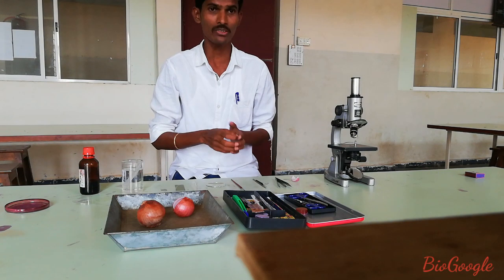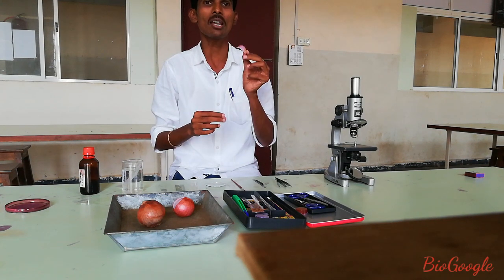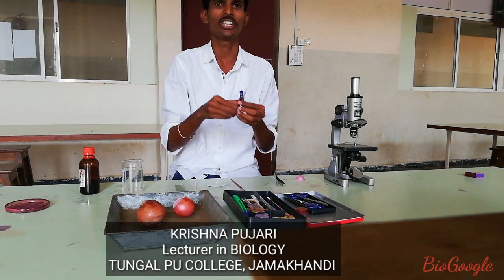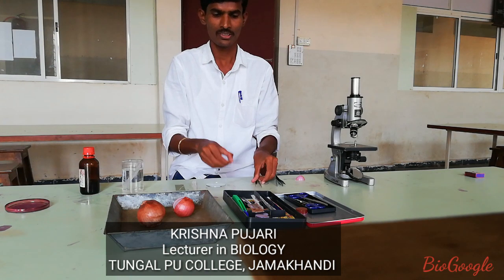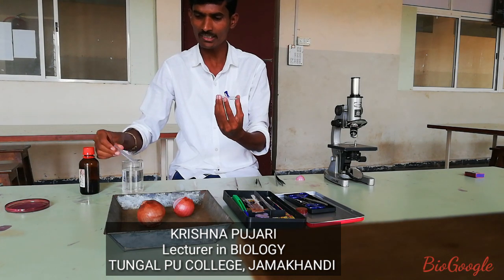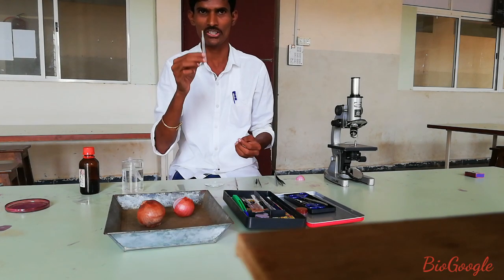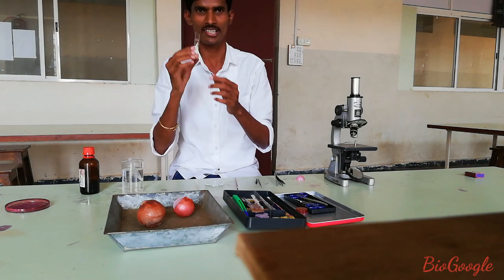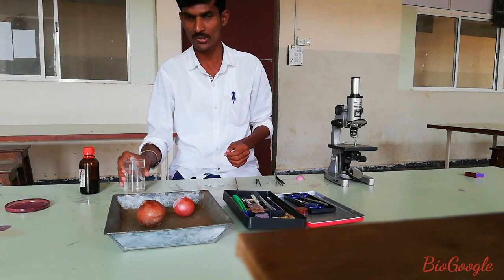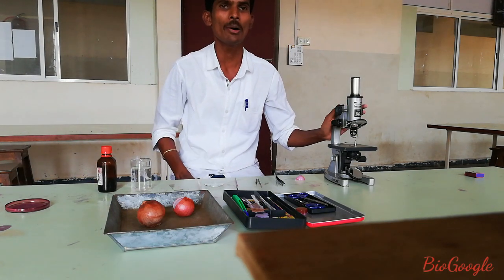Let's start the experiment. First, we know the requirements of the activity: a small piece of onion, a pair of forceps, needles, a brush, a watch glass containing water, a dropper, a slide, water, the staining solution, and finally the compound microscope.